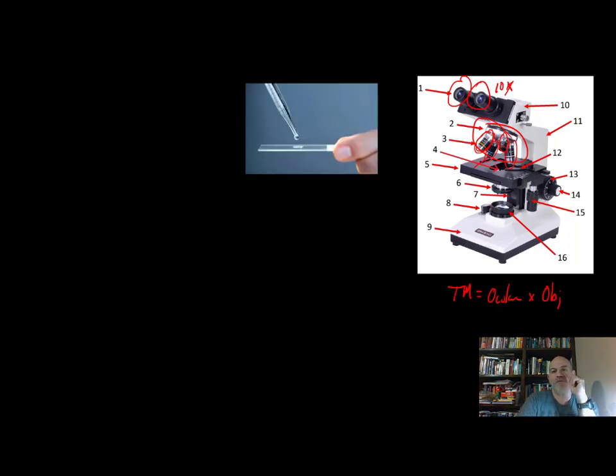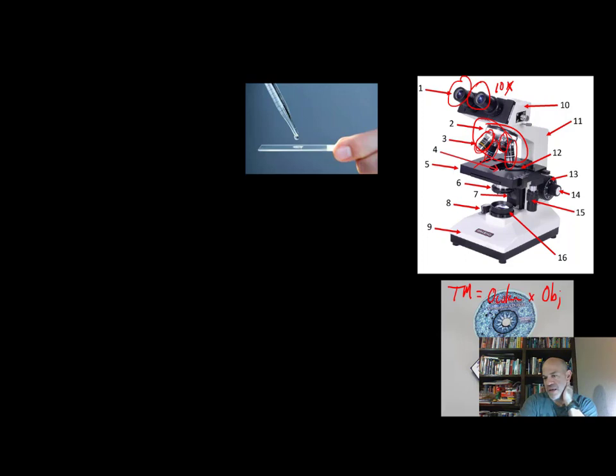1000. So the general idea here is you either prepare a slide or you have a store-bought slide that you see there.